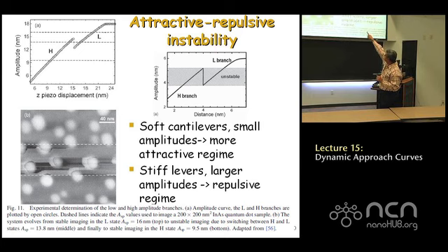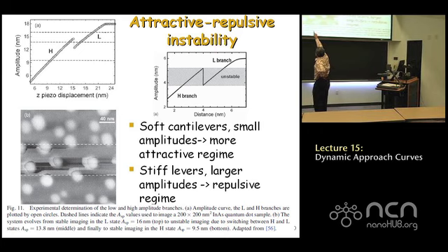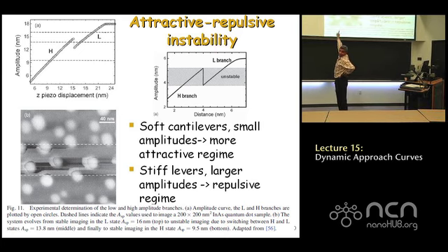But when you choose an oscillation amplitude set point in the middle, see what happens. You see these streaks that happen? If you thought it was just normal topography, if you didn't realize that there are artifacts, you would take that image in the middle, and your conclusion would be that to the right of that dot, you have a black region. By the way, the color coding is according to height. So you would say that, oh, my sample has a black deep trench to the right of that dot, when in fact it's not there, because you change the oscillation amplitude, it disappears. So it has to be an artifact.